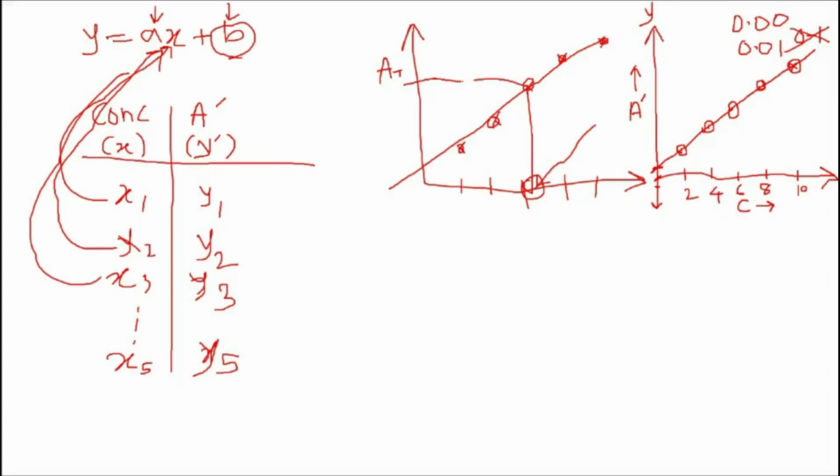मुझे पता है कि वो स्ट्रेट लाइन है और all points are lying on the line, I know. So why should I go searching for those points? I will not go for searching those points. I will directly plot the highest point. I will draw the line, and on the line, against the respective concentration, I will mark the points. You will save at least 5 minutes here. Okay, so in exam every minute is important. Here you are saving 5 minutes. So it is very useful thing.